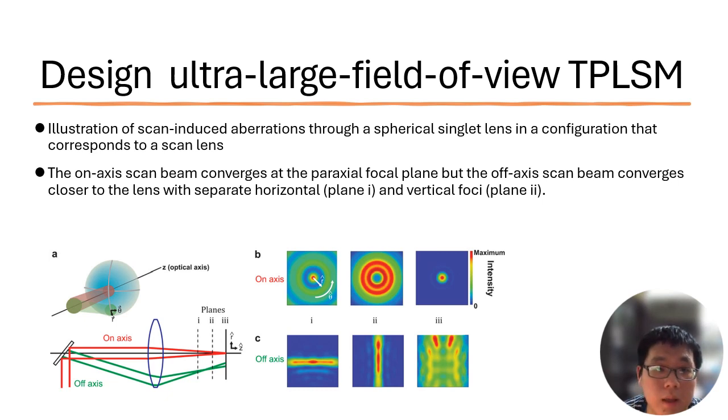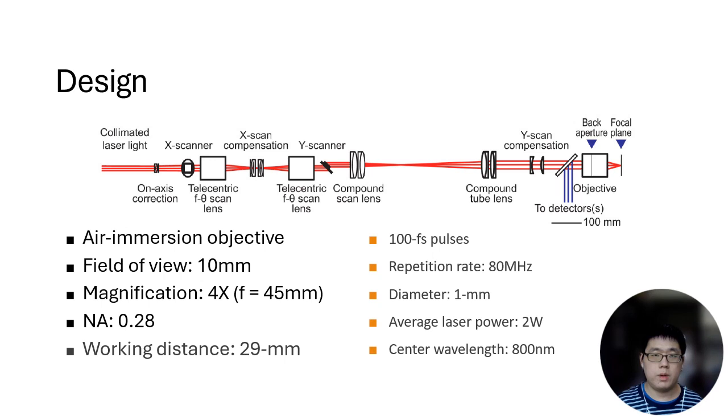The focal plane intensity maps explicitly show the resulting astigmatism. This paper presents a design to mitigate aberration for brain-wide imaging of neural cortex with two-photon laser scanning microscopy.